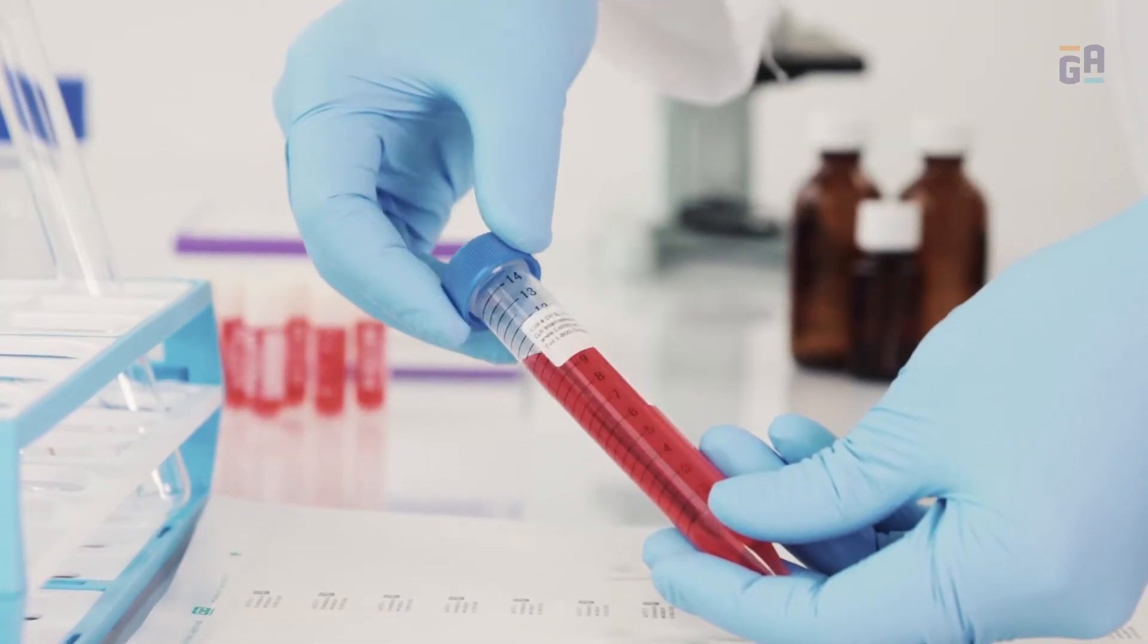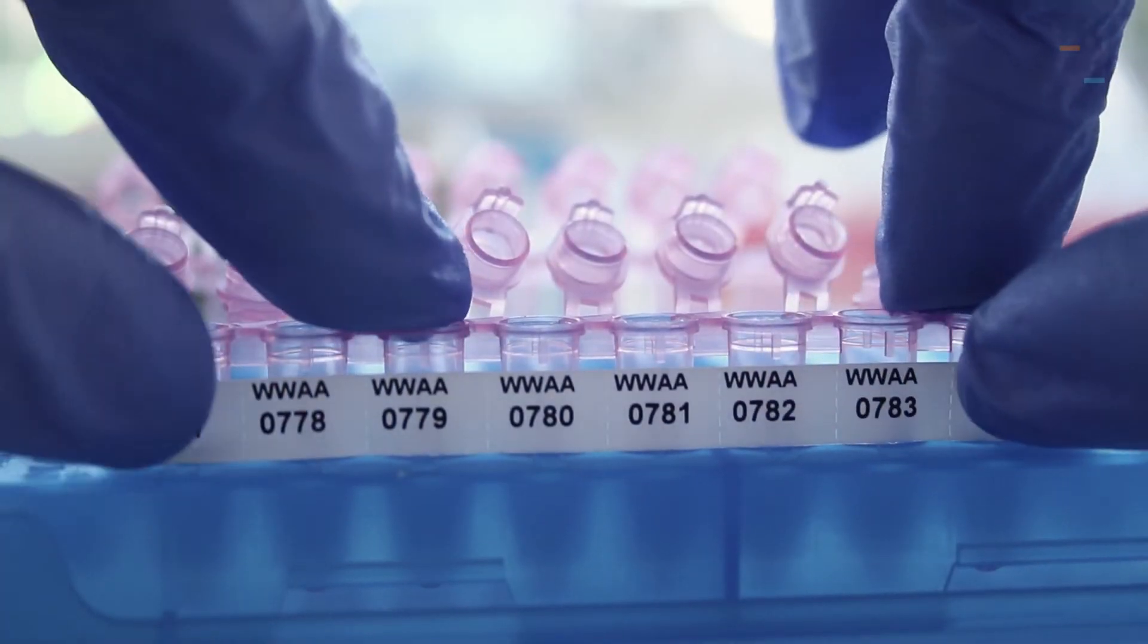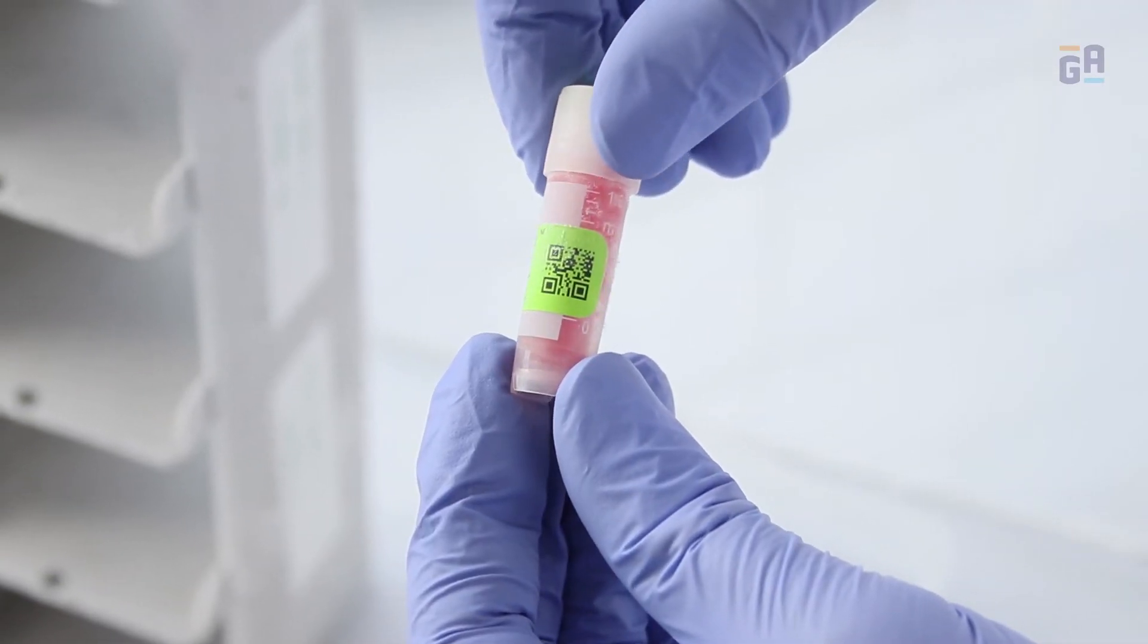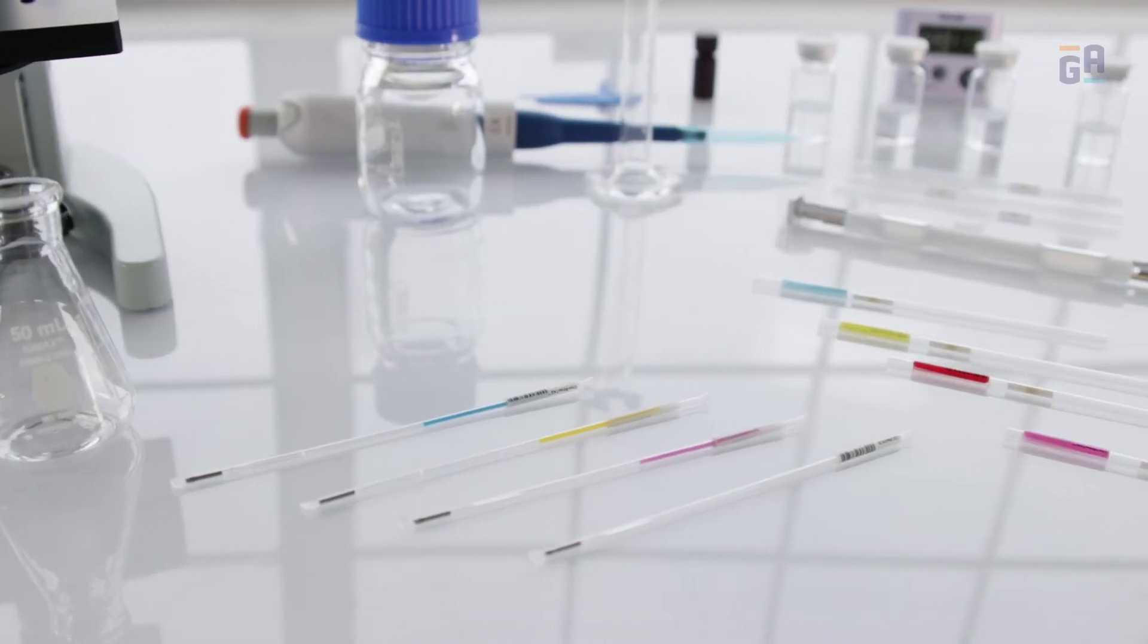They come in a variety of sizes to fit any container, including PCR tubes, 2ml cryo vials, cryo boxes, microplates and IVF straws.